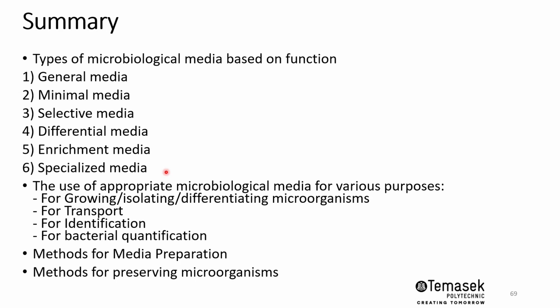There are also specialized media. Some of these specialized media are used in industry, such as the assay media, as well as the transport media, so that you can utilize them for studies and assays, to look at whether microbes are responsive to certain drugs, antimicrobial drugs specifically, as well as keeping them stable when you need to transport some of the cultures from one laboratory to another. We also looked into the use of appropriate media for various purposes.